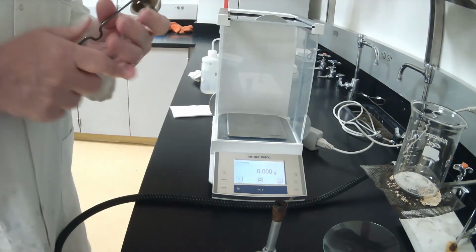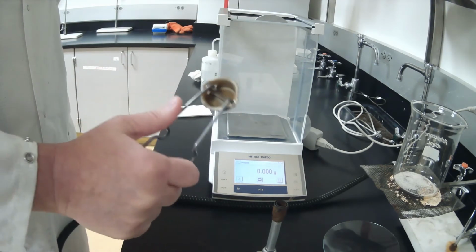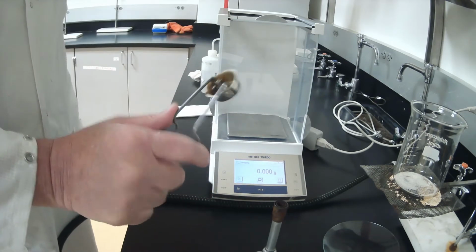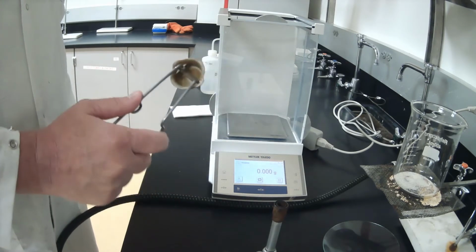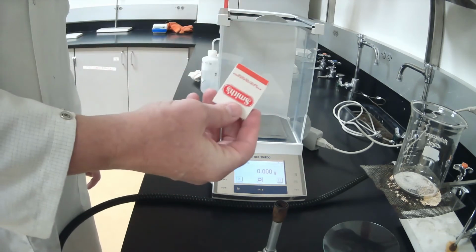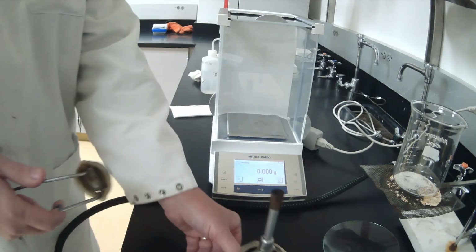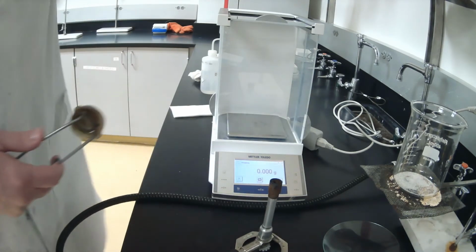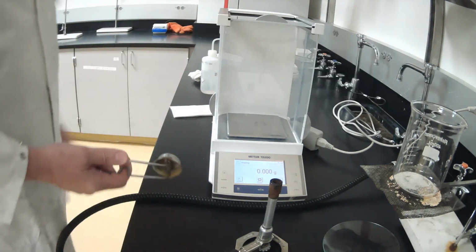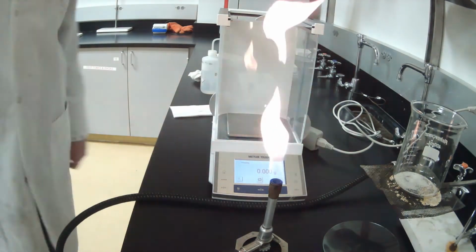There are 2 ways. One is to use a sparking device. You should see a spark when you push the flint across the steel, and it usually takes 1 or 2 sparks to ignite the gas. The other way is, of course, to use matches, but eventually you use them all up. The sparkers just won't work. So we will use a sparker. I'm going to move the Bunsen burner a little bit into view. We're going to reach back, turn the gas valve on a full turn, and when we spark, the flame jumps right up.